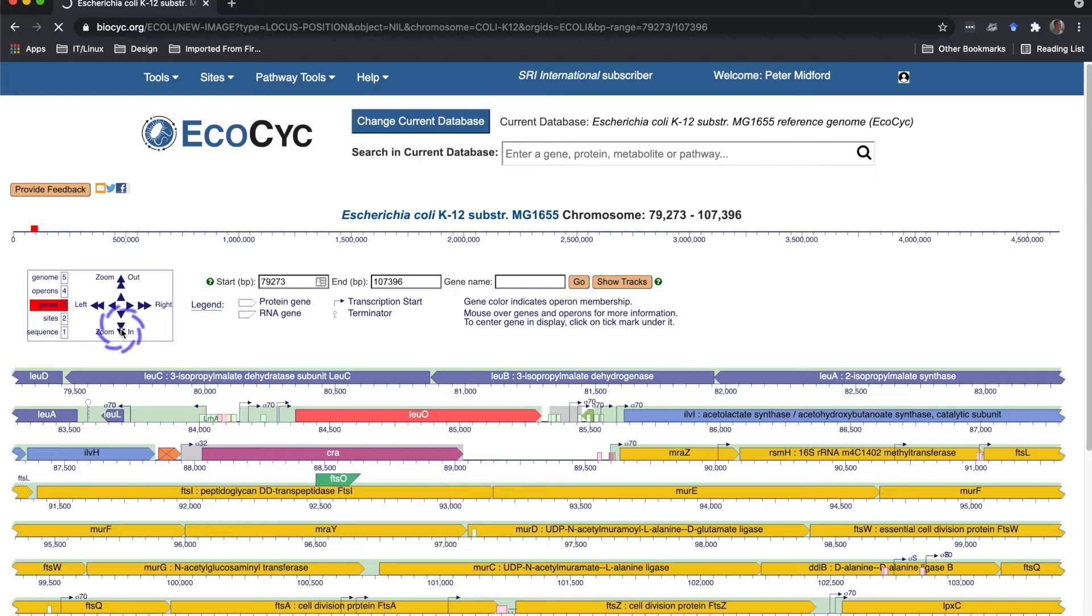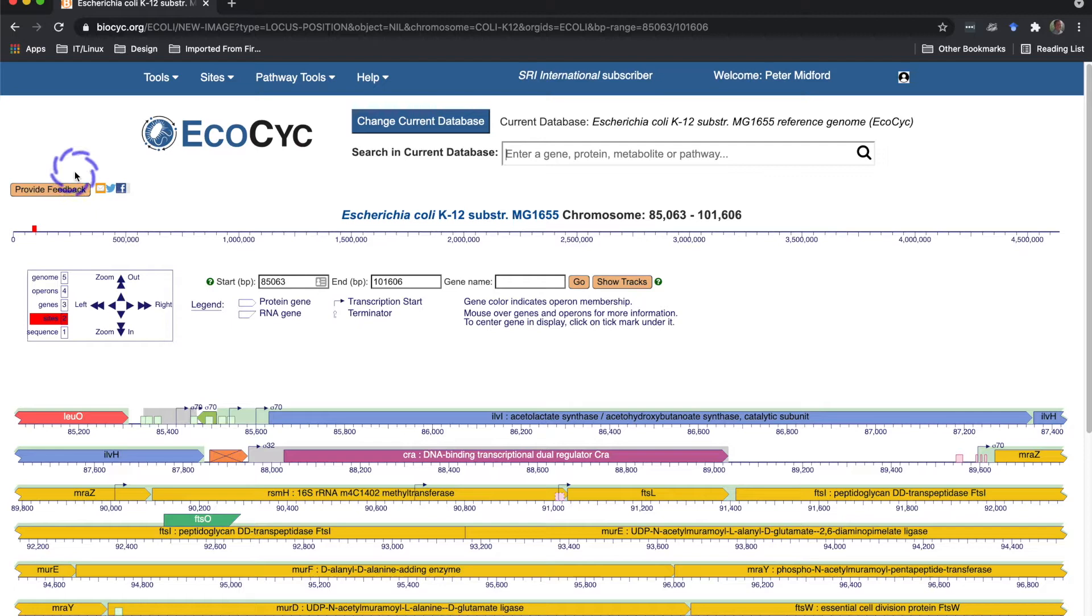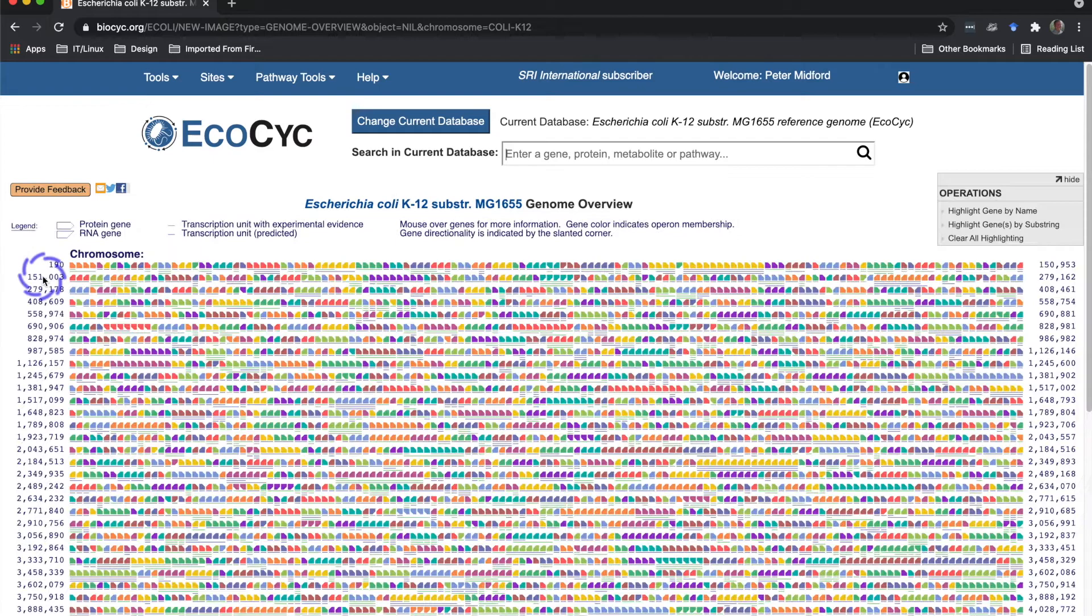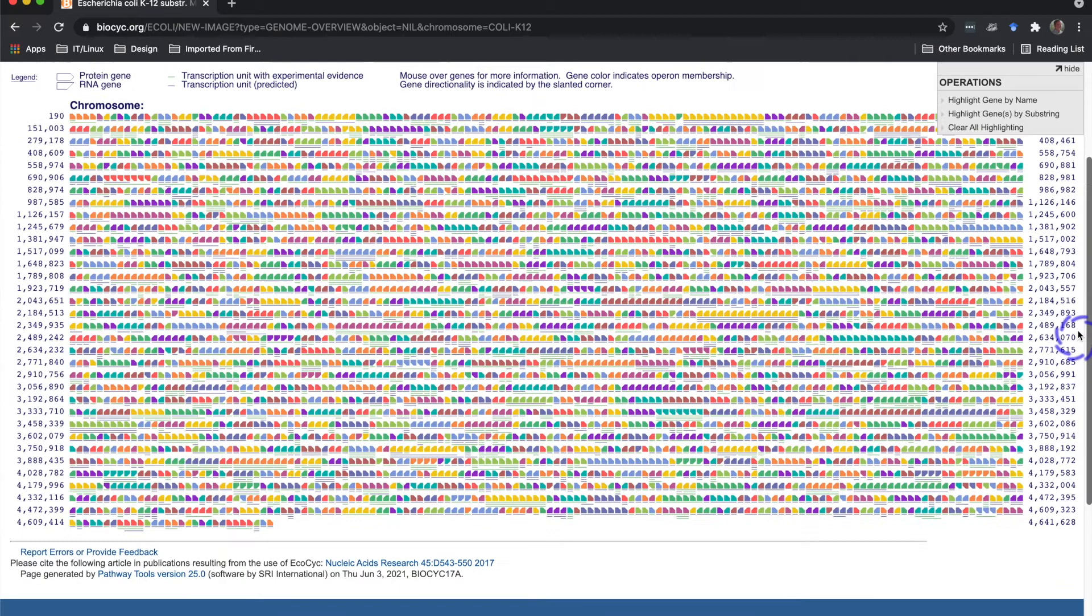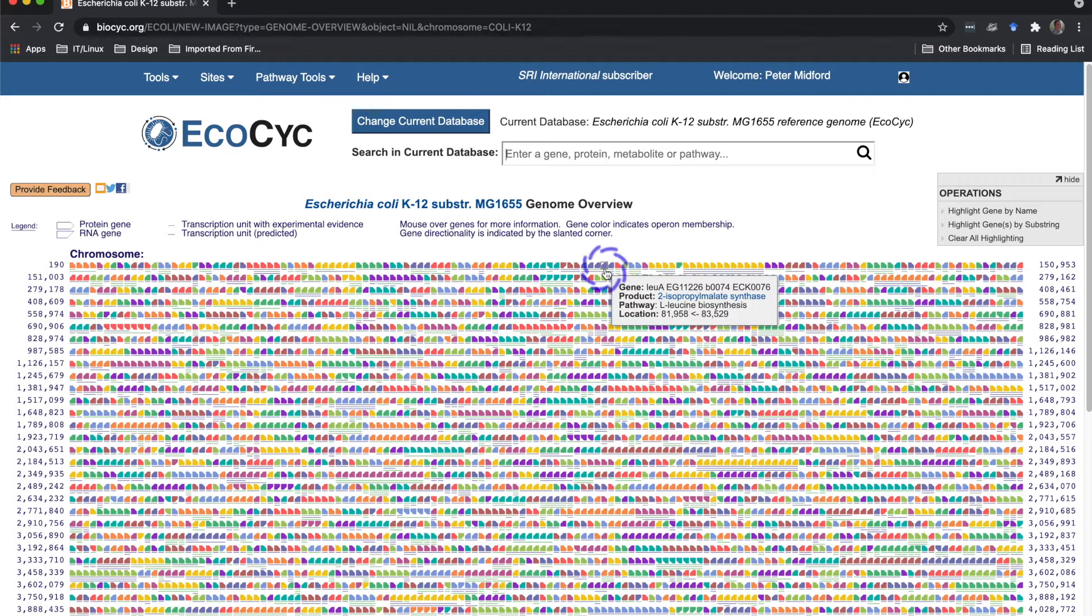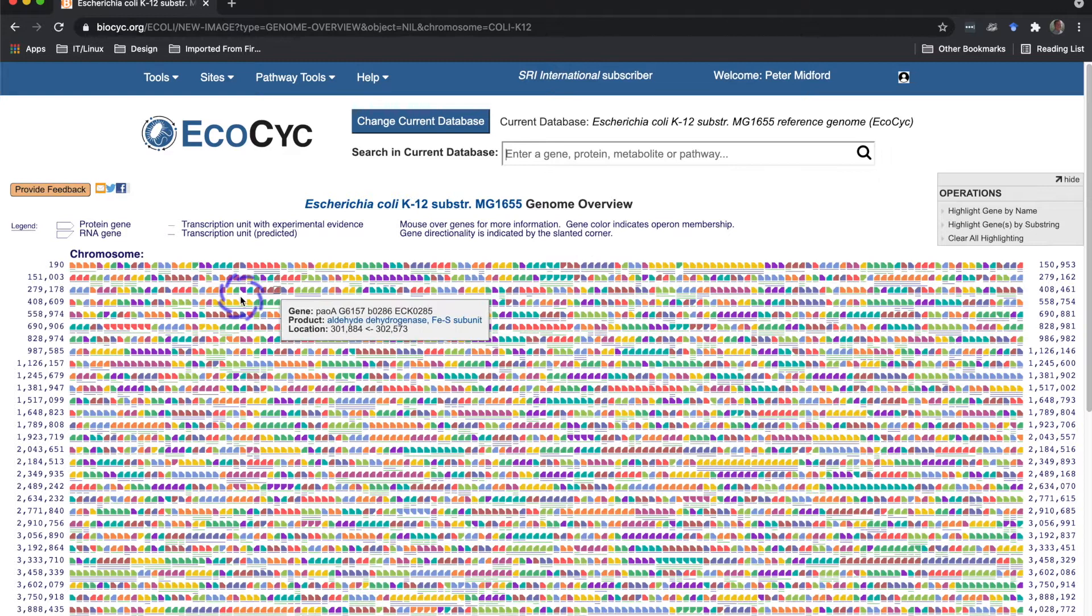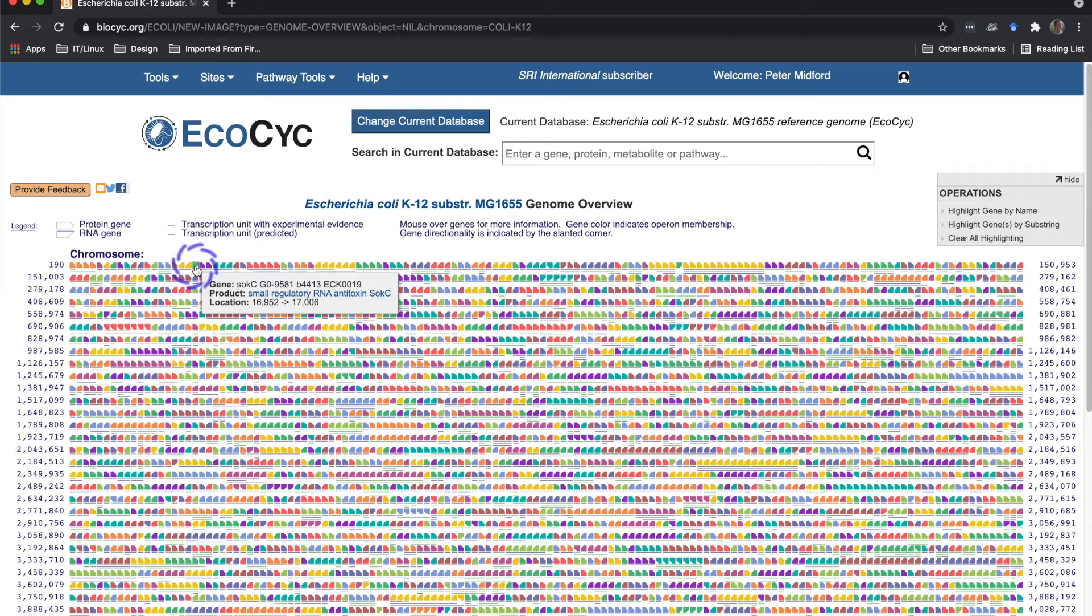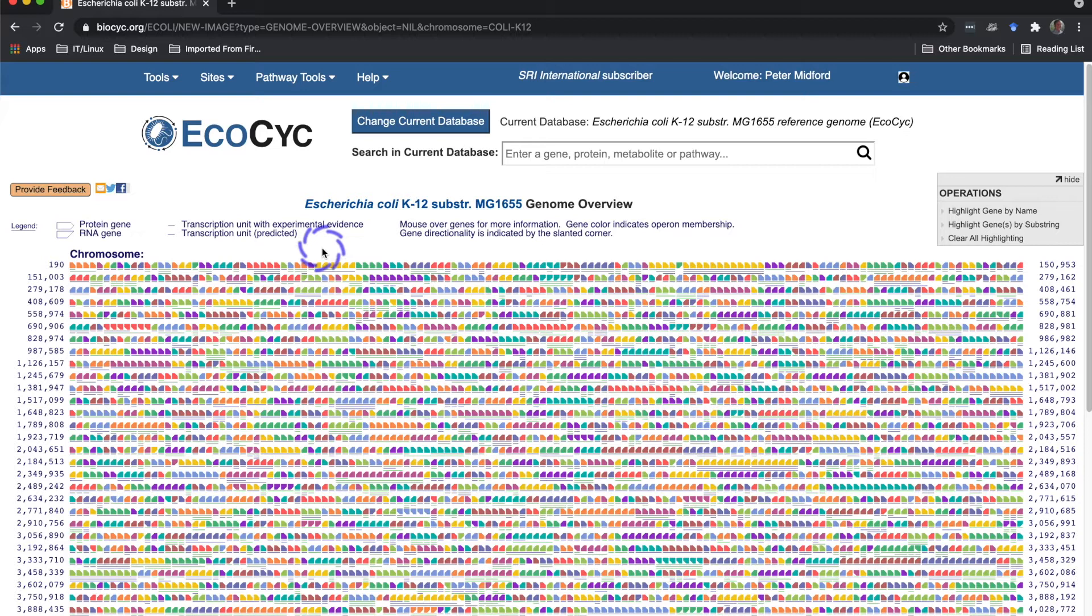I can also zoom out to see what we call the genome overview by clicking here. And here we see almost the entire E. coli genome. Each of these boxes is one gene. Boxes that point left or right are protein coding genes, while downward pointing quadrilaterals like this one are RNA coding. Again, colors represent operon membership and the bars below indicate transcript extents from our transcription unit information.